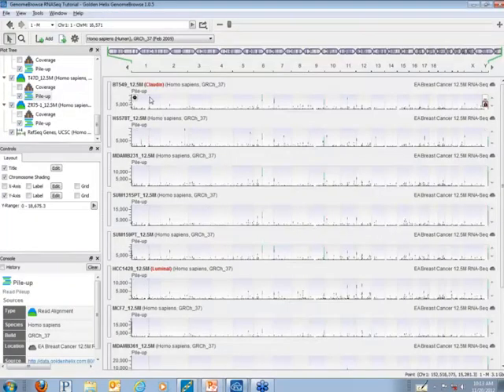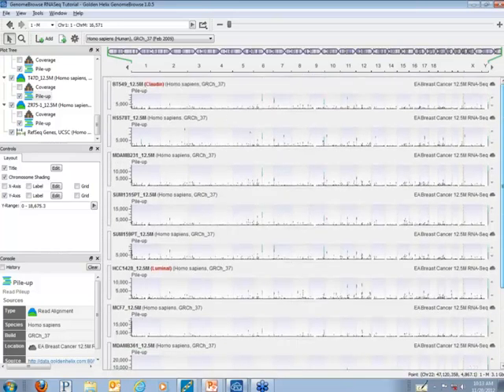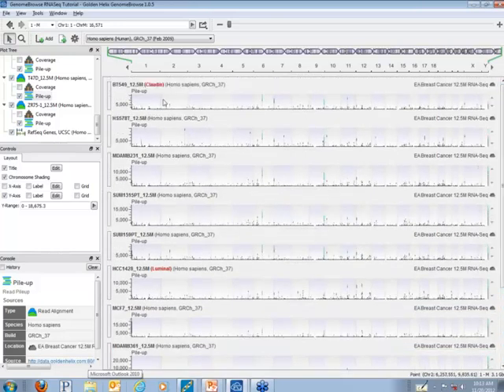This is a Genome Browse project with all 10 samples loaded into it. These samples are streamed live from the cloud. And at the bottom I have RefSeq genes, but I can also add another gene track if I want. Here I've used our enhanced labeling text editor to add in red an indicator that the first 5 samples are the Claudin samples and the next 5 samples are the luminal samples.